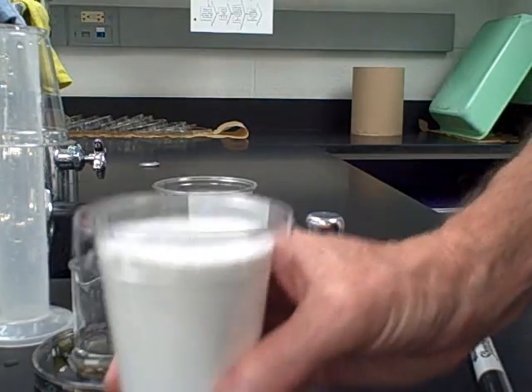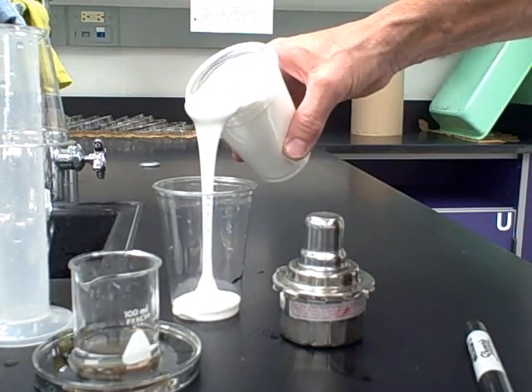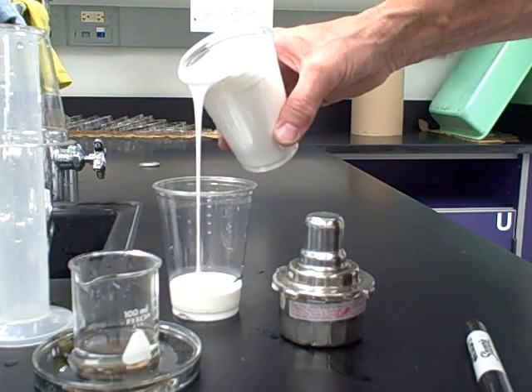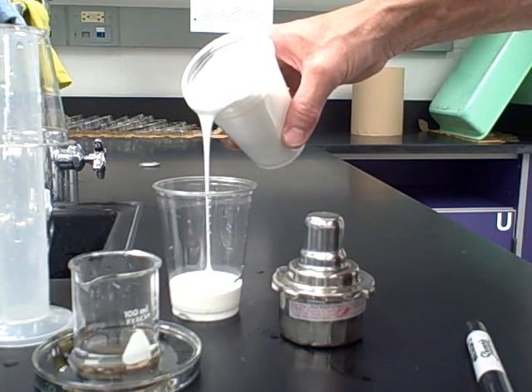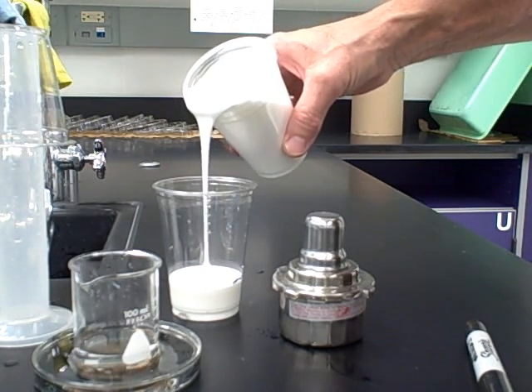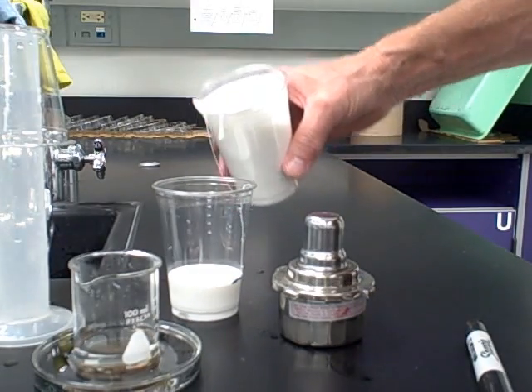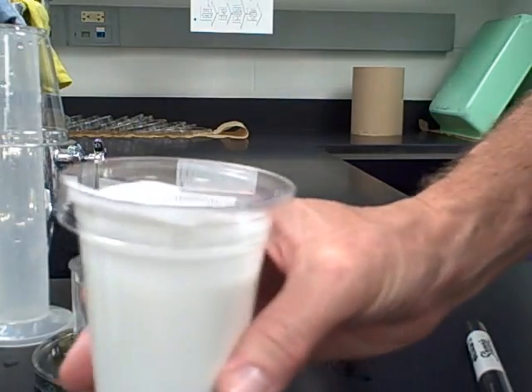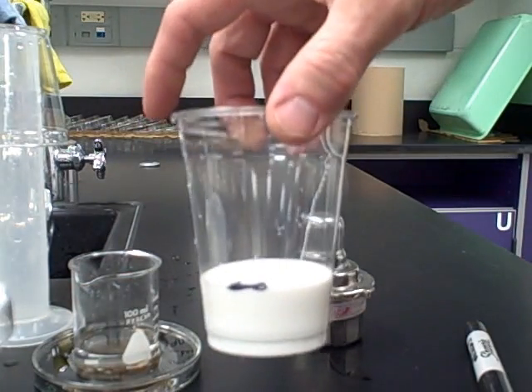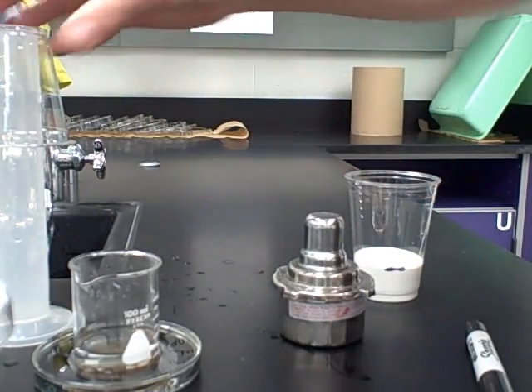Now take the white glue — this is Elmer's white school glue — and pour it into the cup. Please do not pour the glue into the graduated cylinder; it will ruin it. Pour until you reach 60 milliliters, right up to the line you previously marked, then cap it back up so it doesn't dry out.